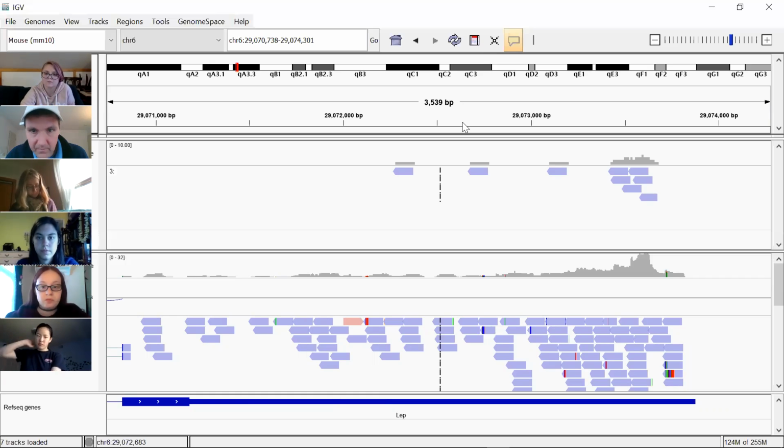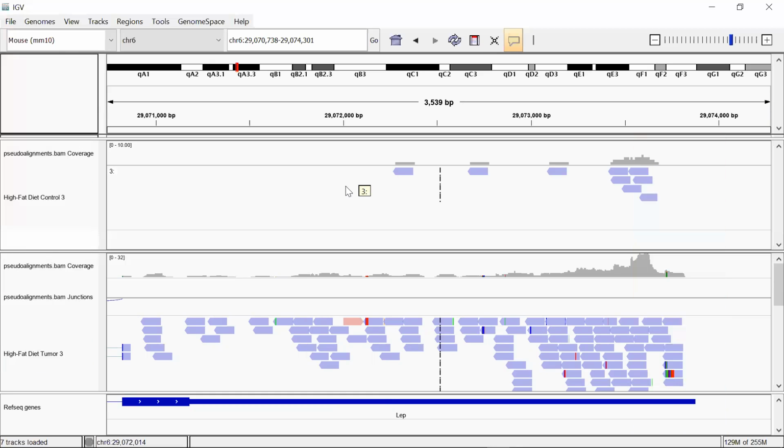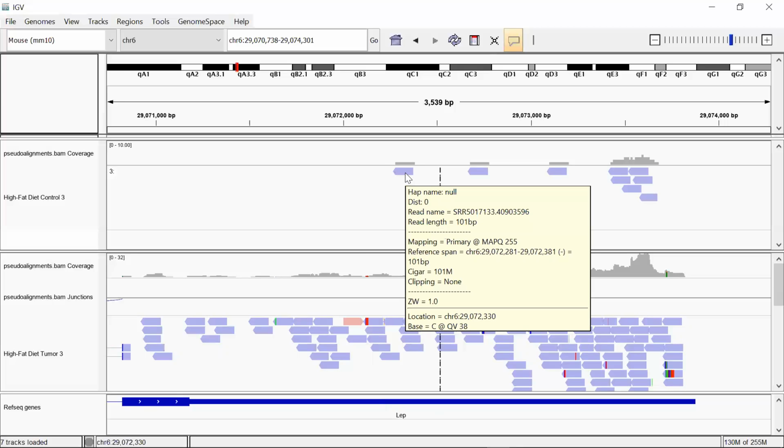Sorry, I do have a question though. I just couldn't get the audio to work. So my screen is empty of all details where your mouse is right now, that section is just completely blank. I'm not sure if I'm not zoomed in close enough or what the issue is.